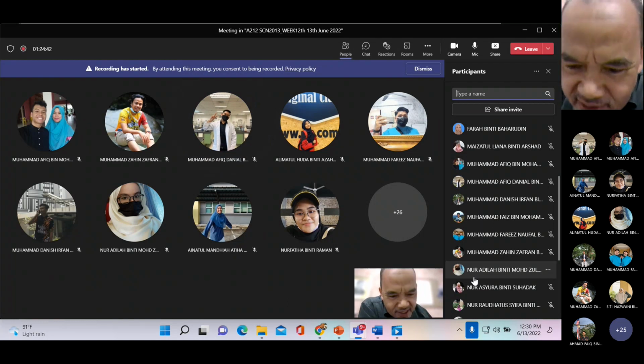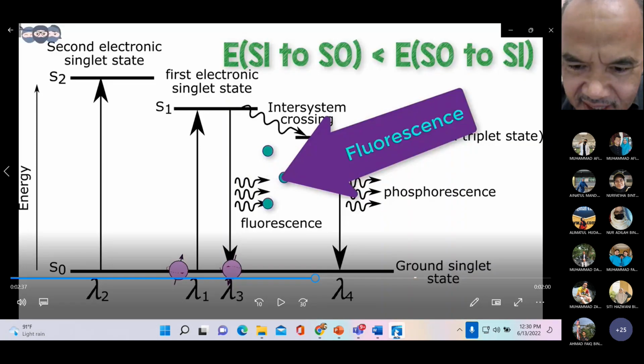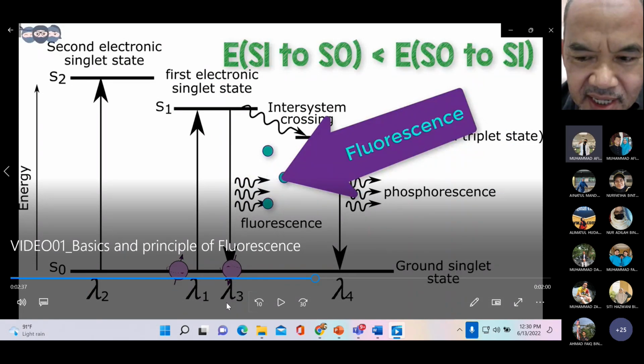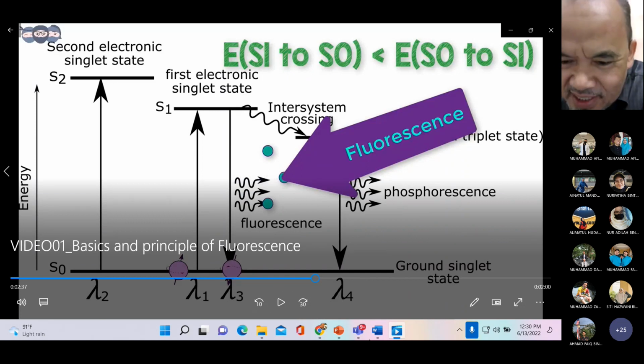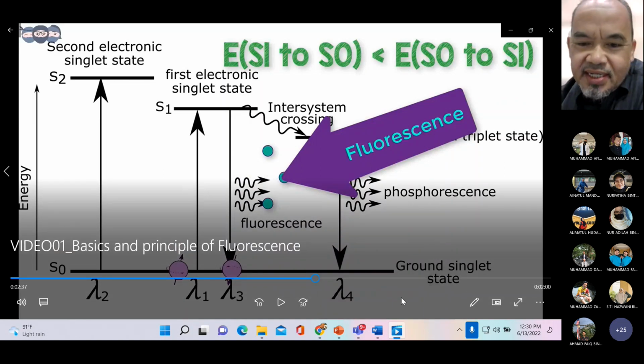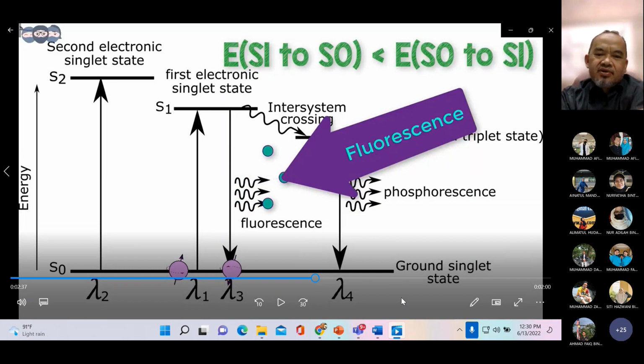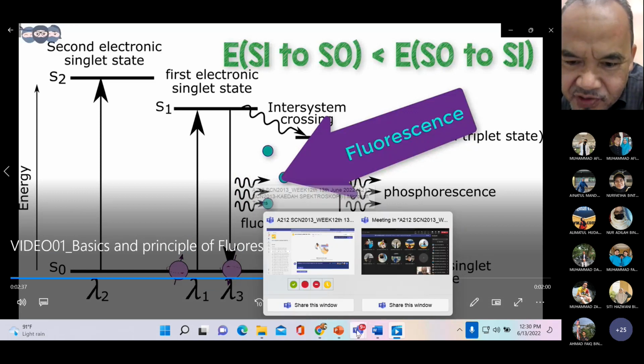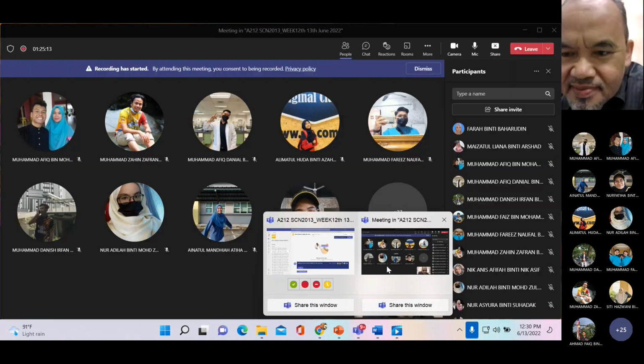Sebab wavelength tinggi. Kalau tengok rajah ni, wavelength dia sini. Ni lambda 4. Jadi lambda 4 lebih besar daripada lambda 3. Betul lah kan. Okey, betul jawapan tu. Tapi mungkin soalan seterusnya: kenapa phosphorescent appear pada panjang gelombang yang lebih tinggi? Alright.